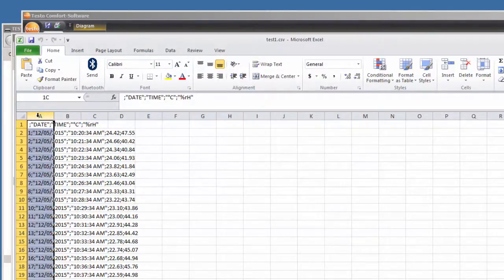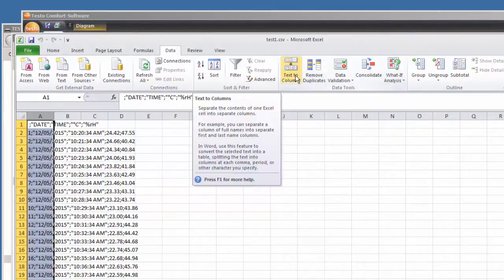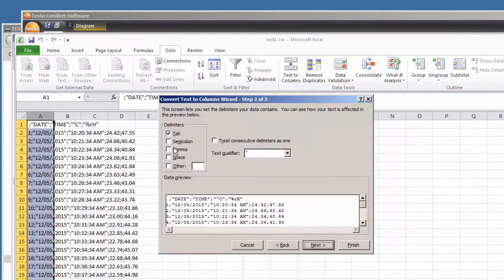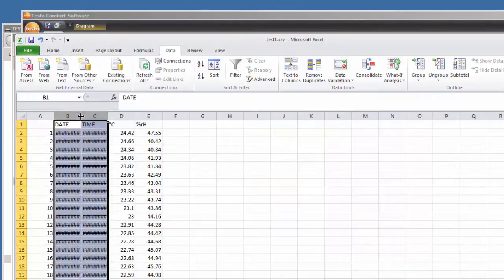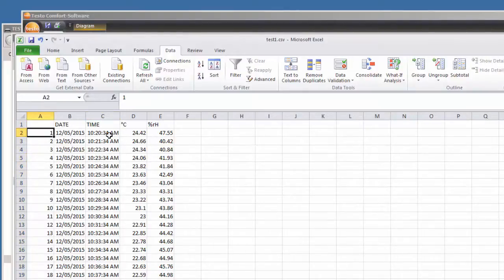Because it's a CSV file, it opens in a single column. To fix that, highlight that column and click on Data, then Text to Columns, and select it as delimited. It's delimited with a semicolon. Click Finish. Now all of our data is nicely in columns — date, time of reading, degrees C, and RH.